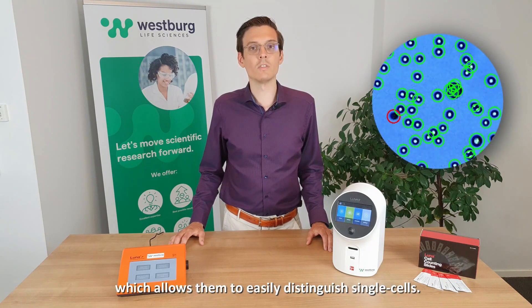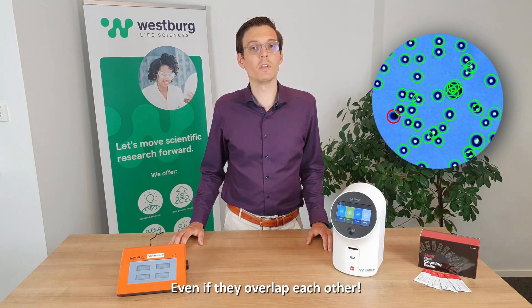Most cell counters struggle with clustered cells, but not the Luna. The Luna has a very powerful counting algorithm which allows it to easily distinguish single cells even if they overlap.